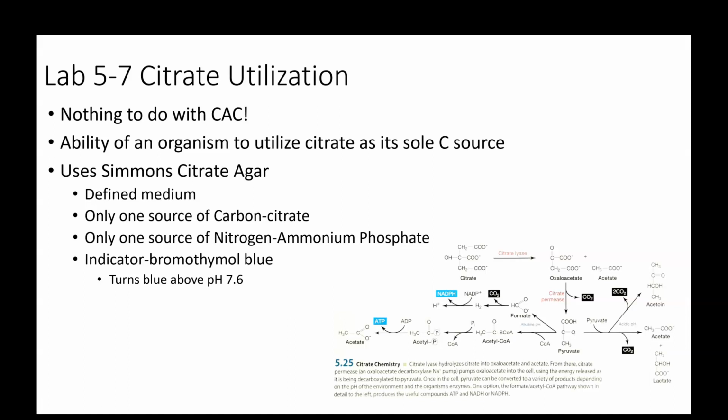The Simmons citrate agar is one of the few agars that we have that is a defined medium. And remember that with defined media, we can trace the molecular amounts of each component of the recipe. In other words, we can calculate the molar quantities of every single part of that recipe.